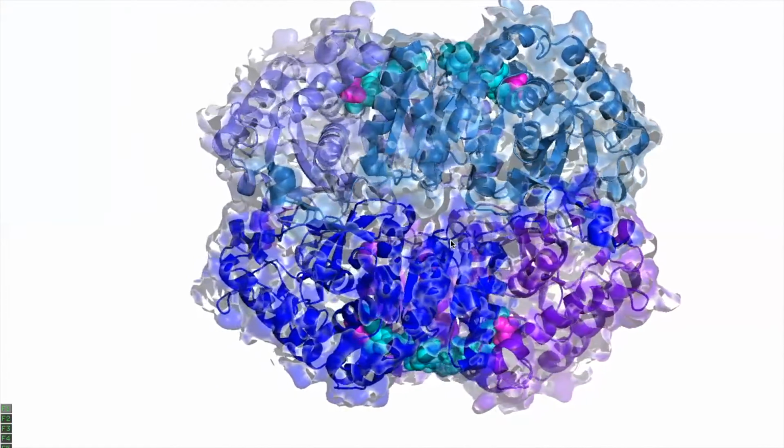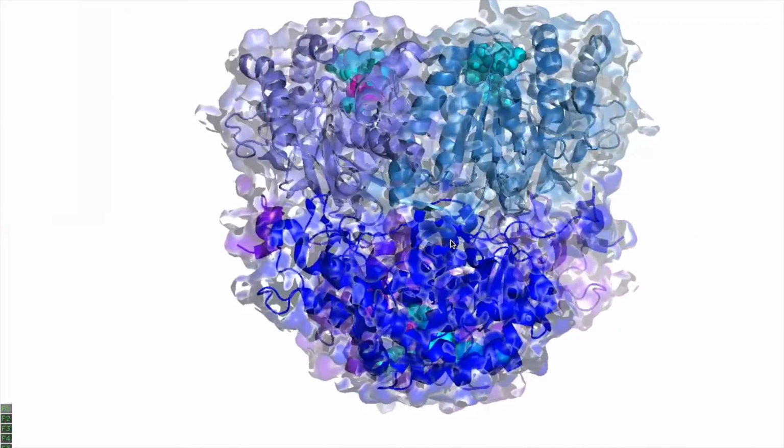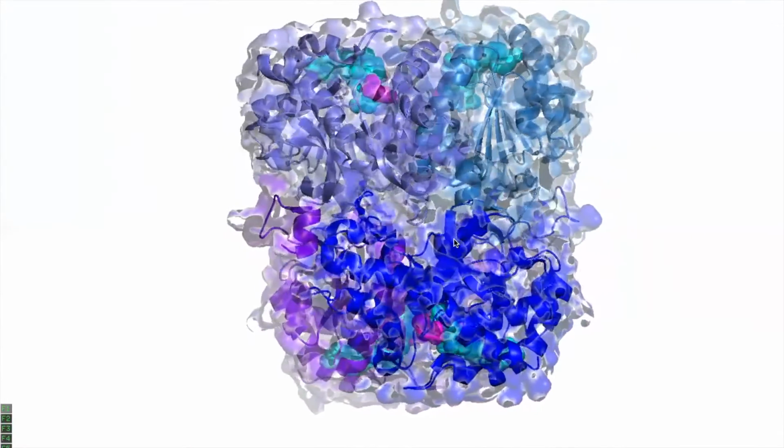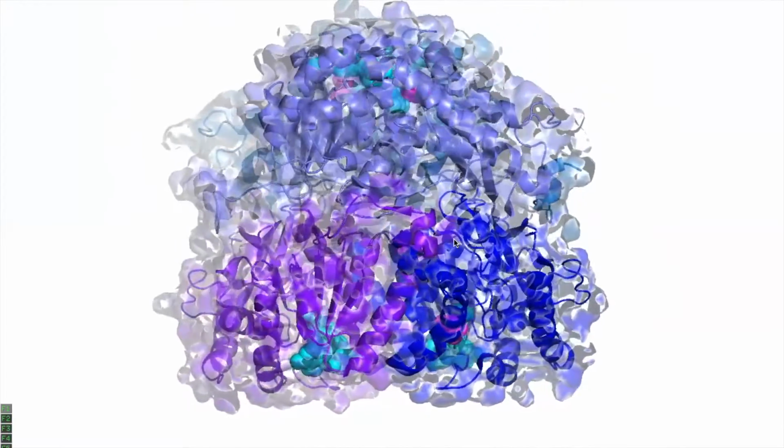The active sites each have malonate, MLI in magenta spheres, and NADH in blue spheres. In this video, I will be focusing in on one active site to tell you about lactate dehydrogenase's role in the anaerobic glycolytic pathway.